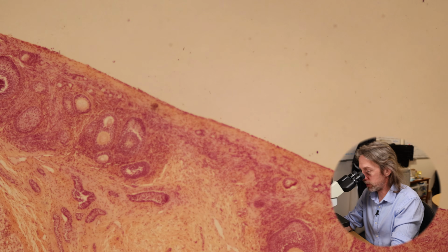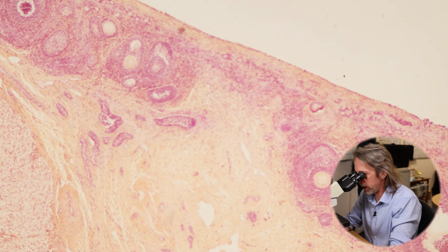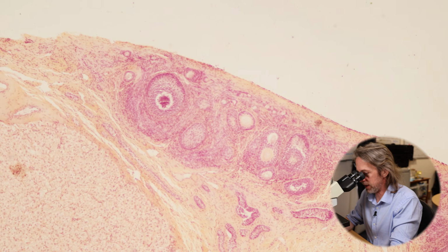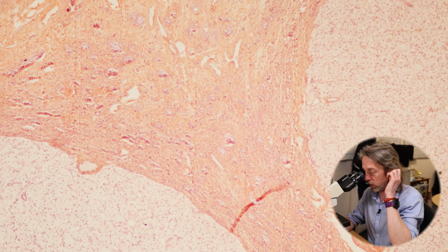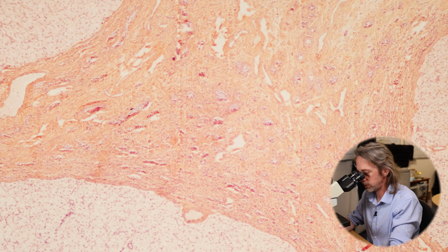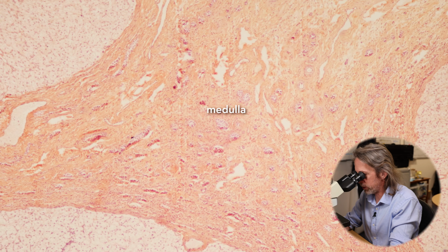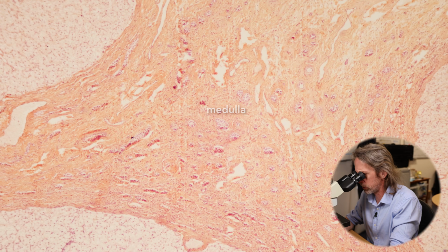Right, let's go back out to my lowest power. And in terms of cortex and medulla, in the cortex, that's where we're seeing these interesting circles. Where the cortex becomes the medulla isn't particularly clear, but as we move towards the centre of the organ, there's one edge, there's the other edge, so in there's the middle-ish, that's the medulla. What we're seeing in the medulla mostly will be blood vessels, lymphatics, nerves, that sort of thing, right?